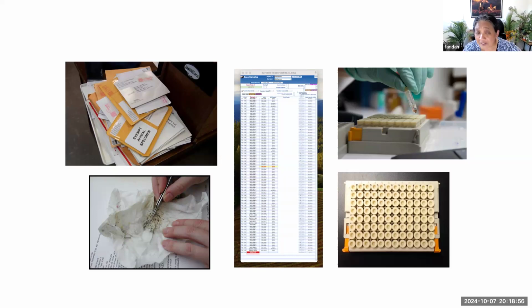We will give it a number. Every sample that goes through our lab gets a barcode that is generated by our lab, and we scan it inside our database. After we scan each one of them, we sample it according to the well number that we are using. It is a 96 well plate, and it's numbered 96, with the last one being negative.